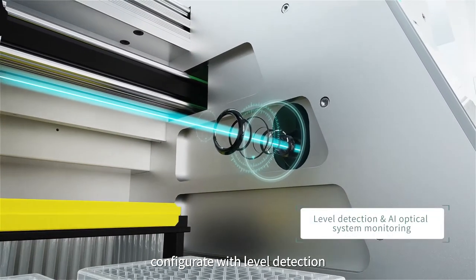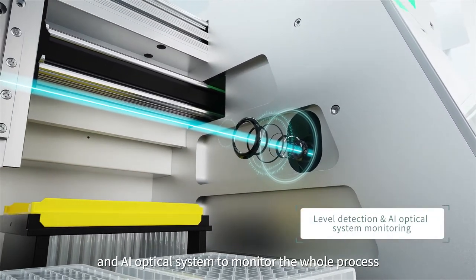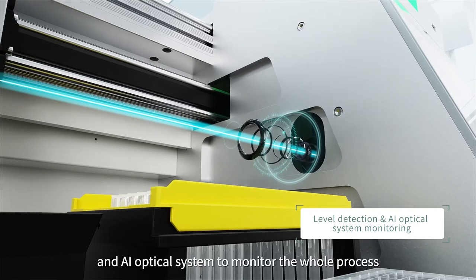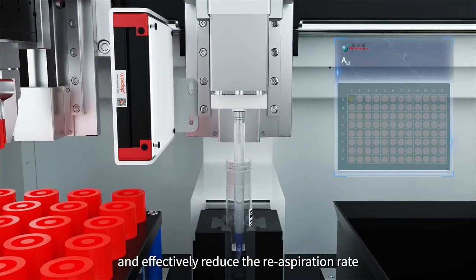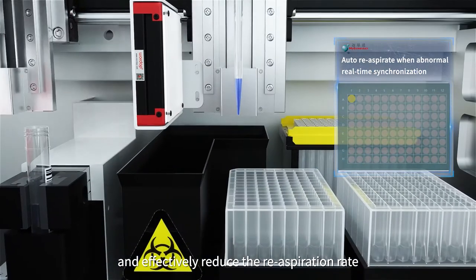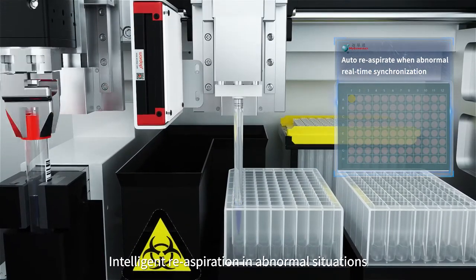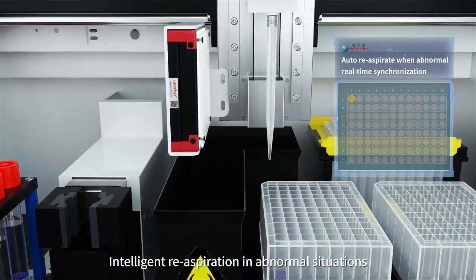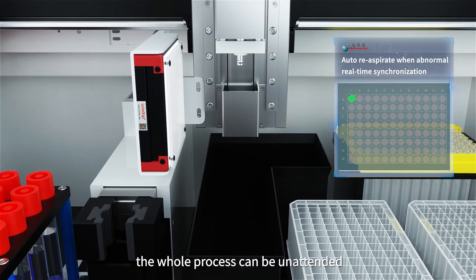Configure it with level detection and AI optical system to monitor the whole process. Ensure the aspiration is accurate and effectively reduce the re-aspiration rate. Intelligent re-aspiration in abnormal situations. The whole process can be unattended.